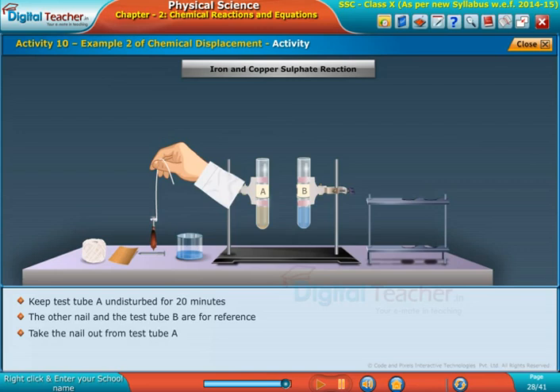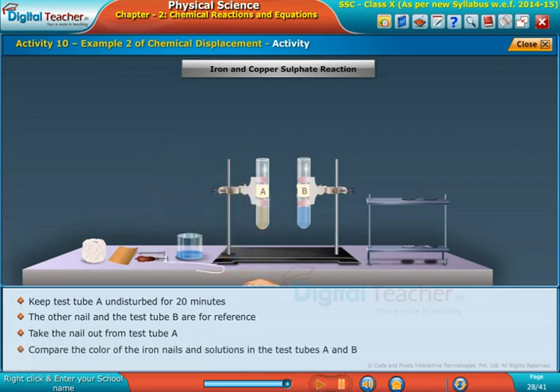Take the nail out from the test tube A. Compare the color of the iron nails and solutions in the test tubes A and B.